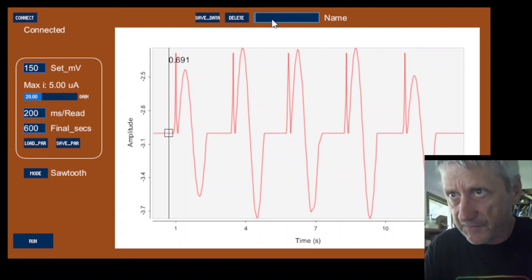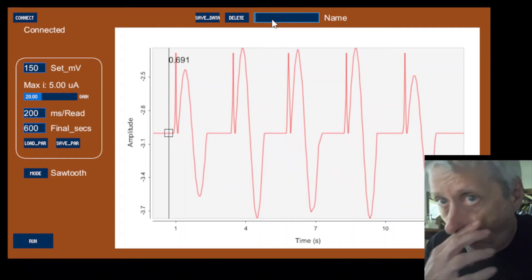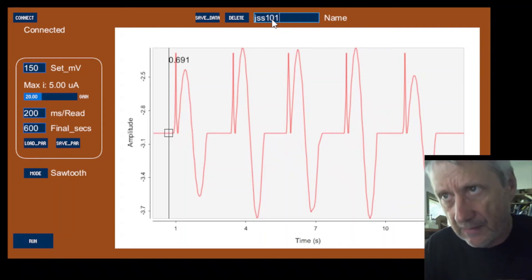Before we do, let's give it a name. Let's call this JSS. Can't type JSS. Let's say it's on page 101 of book 23. Okay, so just giving it some random name. Now I'm going to hit save data, which calls up a thing that allows us to enter a name and to save it, and I want to do that.